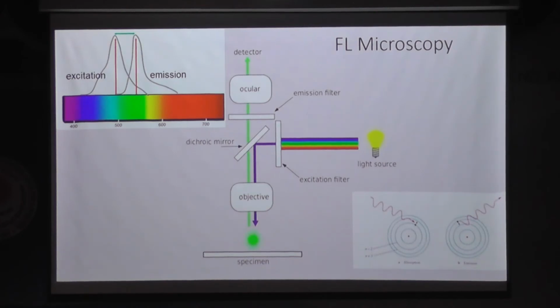There is one more thing we need to study: this is the visible light range. There are many waves. Even the infrared, which happens to be here, is waves, but we will not be able to notice it with naked eyes. There is something here, UV rays, before this. So anything between 400 and 700 is visible. The wavelength I'm talking about, 400 to 700, is visible light. That is the VIBGYOR colors. But before that is ultraviolet, and after that is infrared.